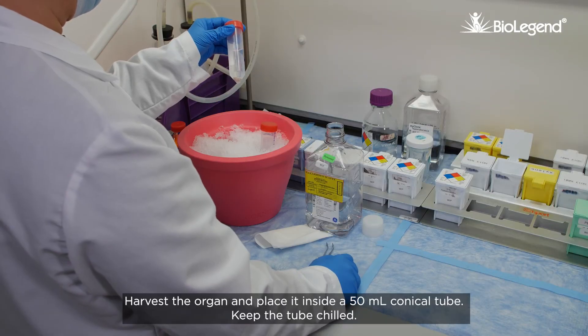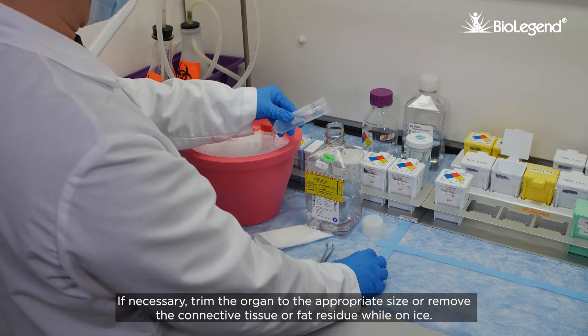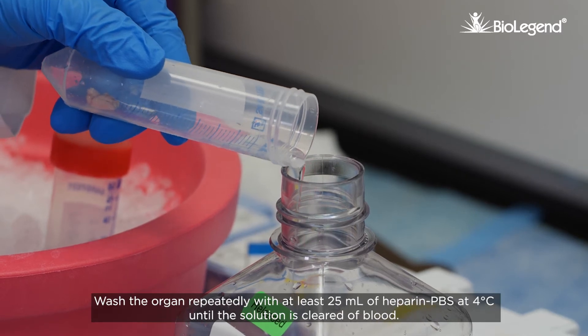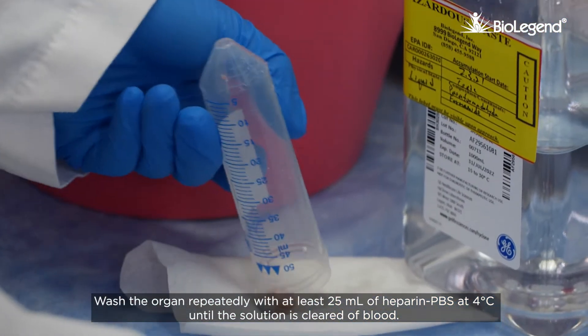Harvest the organ and place it inside a 50 milliliter conical tube. Keep the tube chilled. If necessary, trim the organ to the appropriate size or remove the connective tissue or fat residue while on ice. Wash the organ repeatedly with at least 25 milliliters of heparin PBS at 4 degrees Celsius until the solution is cleared of blood.